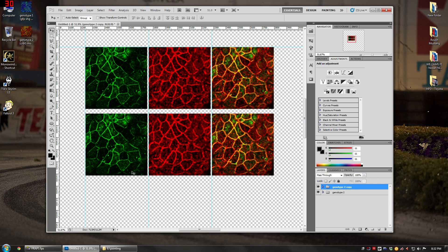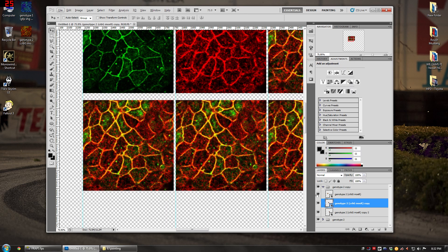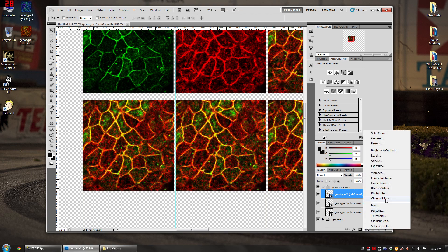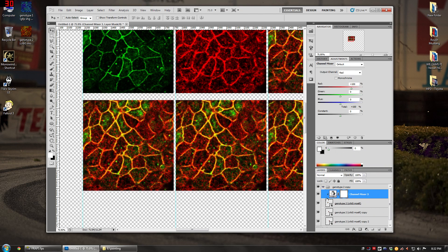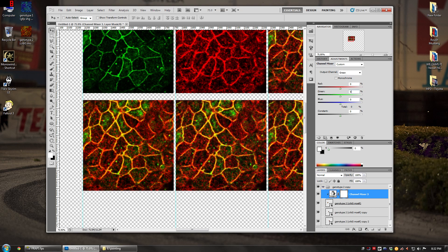Now let's say you want to flip the colors — make green appear red and red appear green. Delete the existing adjustments and use the Channel Mixer again. This is a bit more complicated but follows the same basic principle. Turn off blue since we won't be using it, then go to the red output channel — we want the green channel content to appear here.